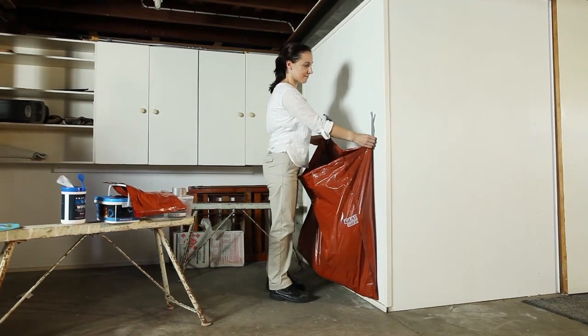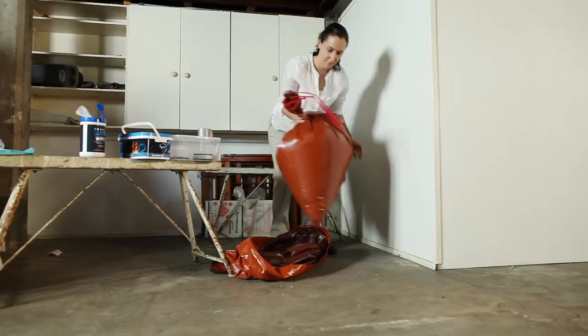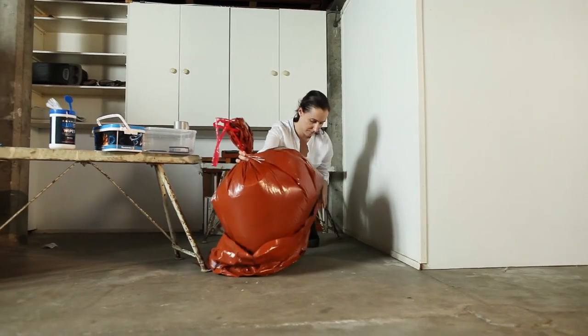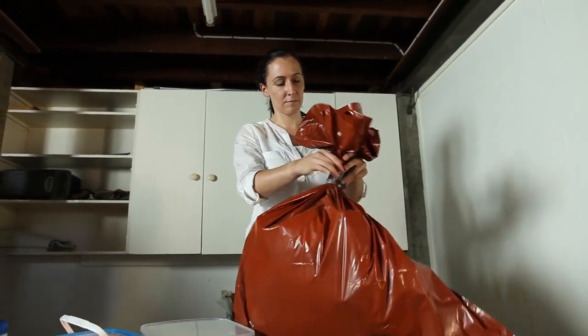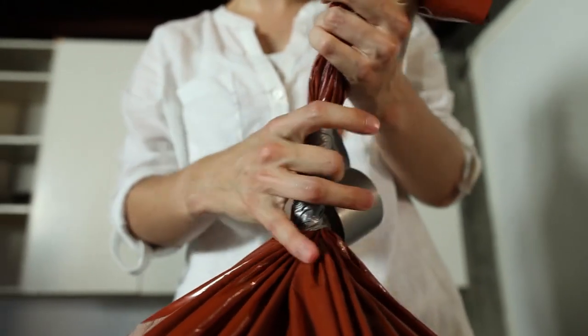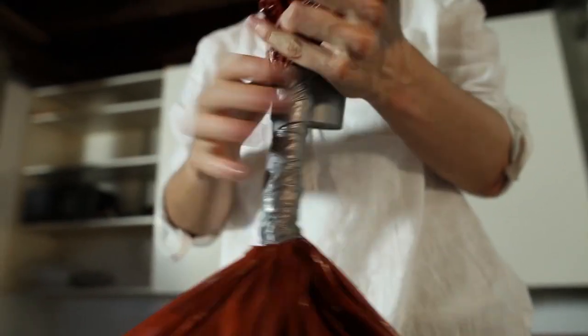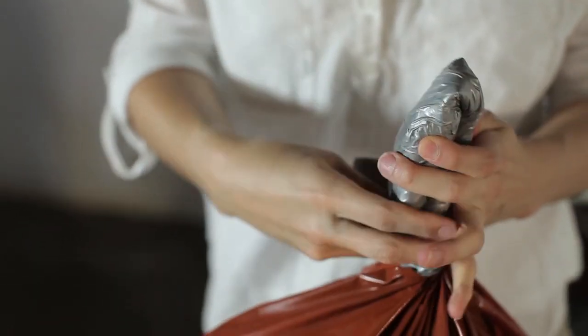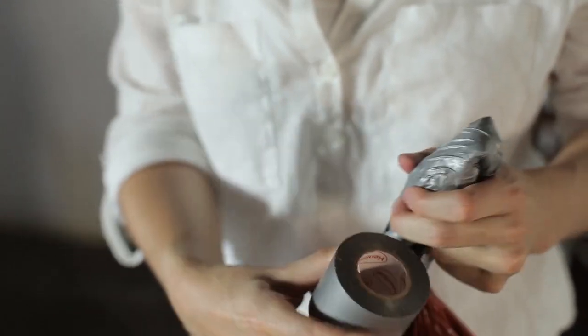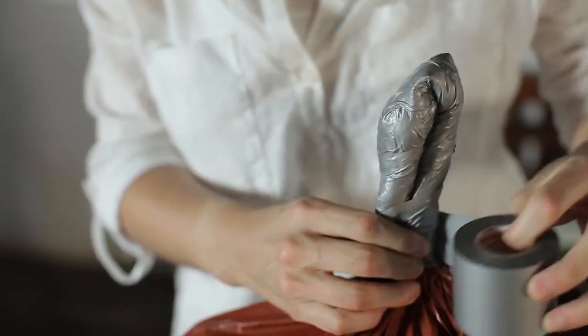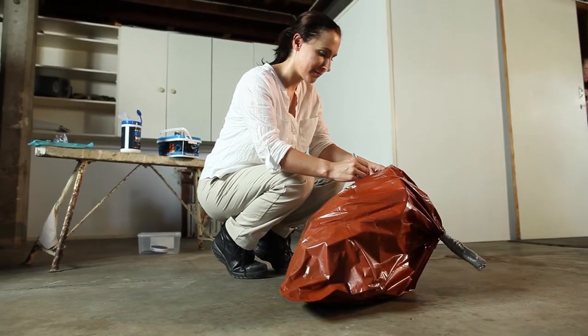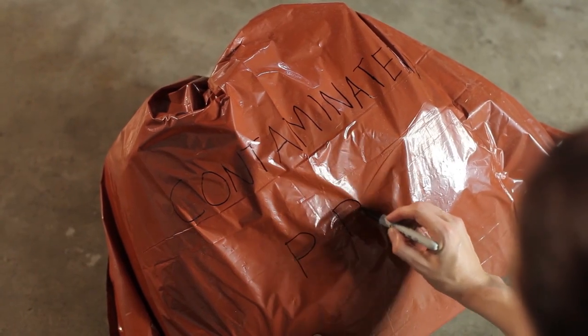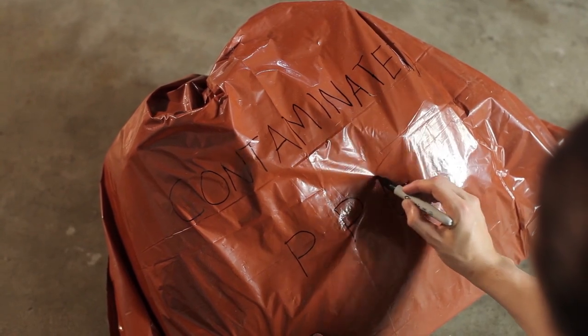When disposing of contaminated PPE, seal the first bag and then place it into a second waste bag. Seal the outer bag via a gooseneck. Hold the bag about one third of the way from the top and while twisting tightly, begin taping the bag using duct tape. Once you have taped to the top of the bag, fold the taped section in half and tape the folded parts together to the top of the fold. Label the outside of the outer bag with the words contaminated PPE. Dispose of the waste according to local council laws and waste sites.